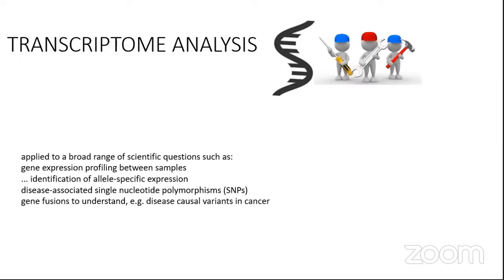So let's begin for today's session. Today we are going to discuss transcriptome analysis. What is transcriptome analysis? How is it beneficial for us? And why are we doing transcriptome analysis? What are the tools we have to use for transcriptome analysis? Why are we doing this?